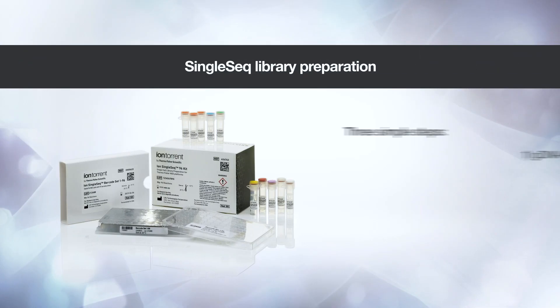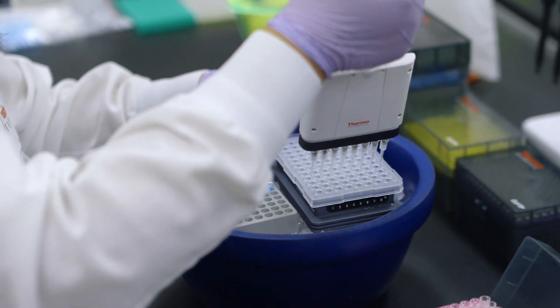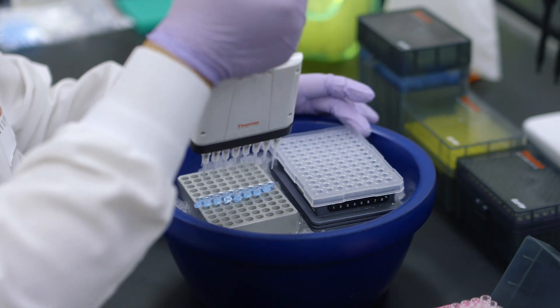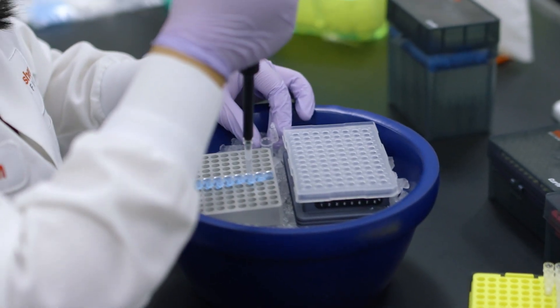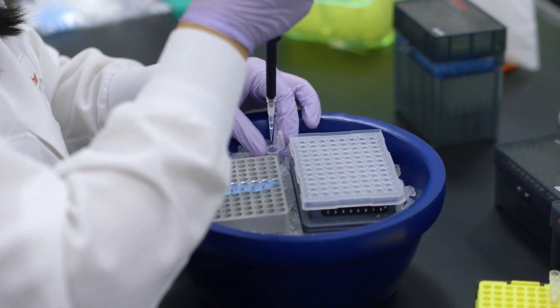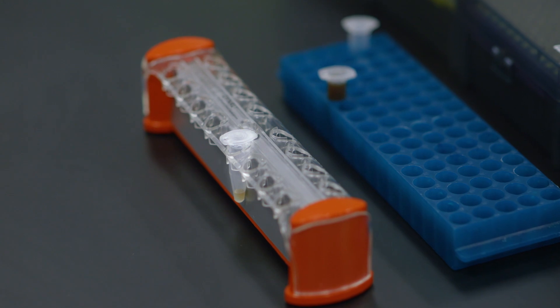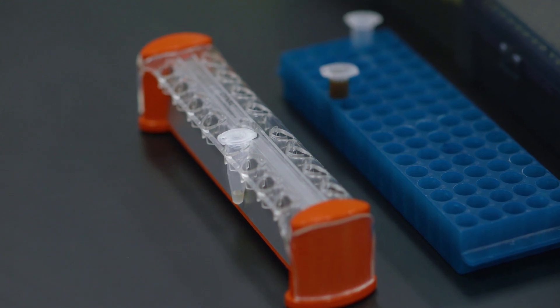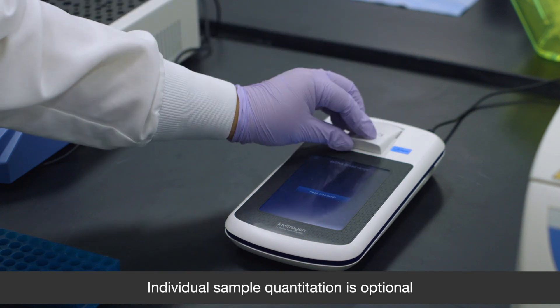Within the third and final stage, libraries are pooled, purified, and quantified. Using a multi-channel pipette, transfer aliquots from up to 96 libraries into an 8-tube strip. Then use a standard pipette to combine into a single tube. The library pool is then purified using a rapid bead method, and lastly, the library pool is quantified.